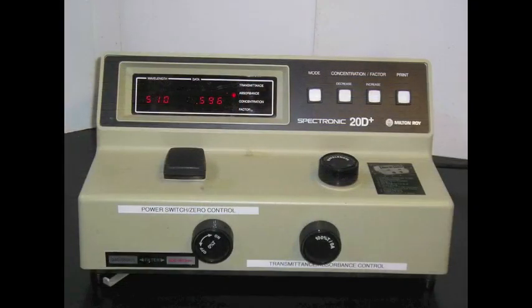A Spectronic 20 instrument operates at a single wavelength of light at a time which the operator can set. If the substance you're interested in can be treated chemically so that it is colored, or if the substance is already colored, then spectrophotometry is a quick and sensitive means of determining how much of that substance is present. Now we're going to move to the board and I'll talk about Beer's Law.